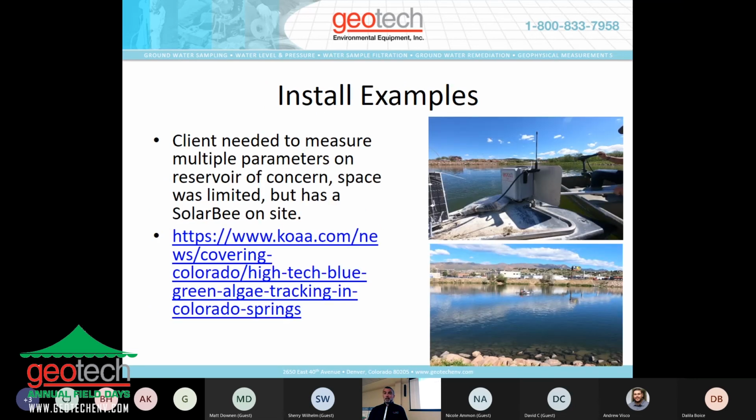Which brings up another thing, is some install examples. All right? So on this one, and I'm hoping the video is going to work on this because this is a fun one. This is a site we did last year. The customer had an issue with a reservoir. It's a HABs issue, that's harmful algal blooms. It's also a publicity issue because this reservoir happens to be in the middle of a city. People fish on it. People have biking paths going past it. And when they have to put the caution tape around the reservoir and tell people they can't fish there, they can't play with the water, they can't touch the water, that's a public relations issue in addition to the treatment issue for the water treatment plant.